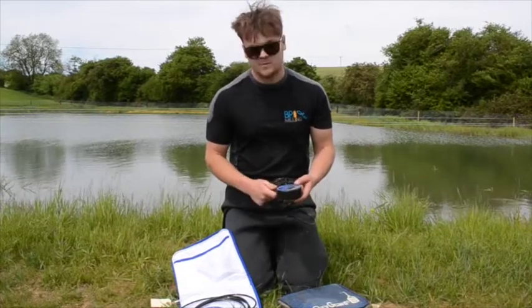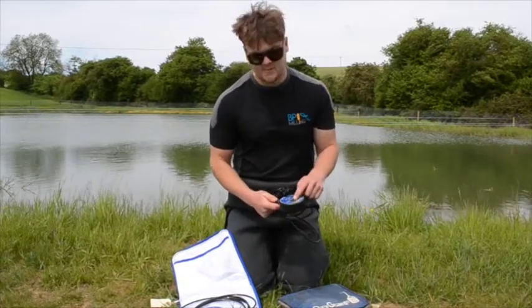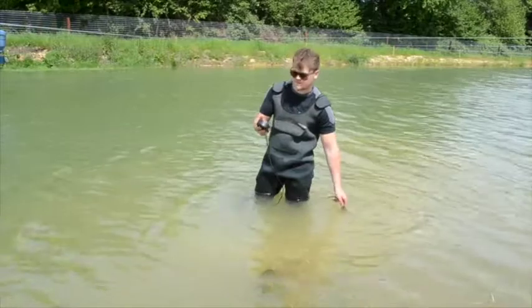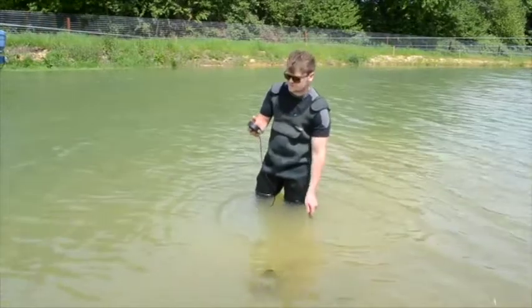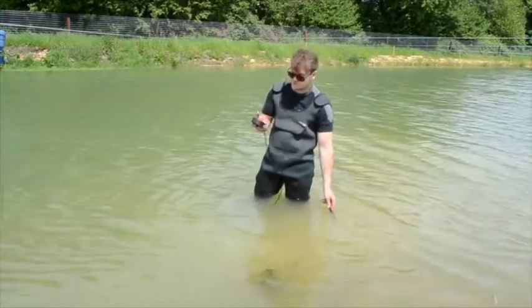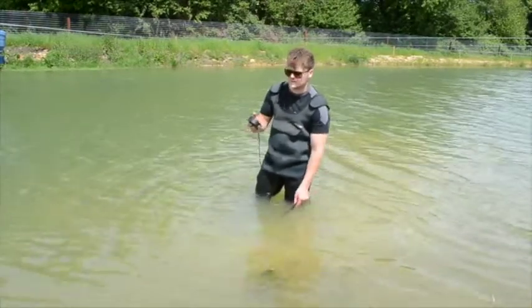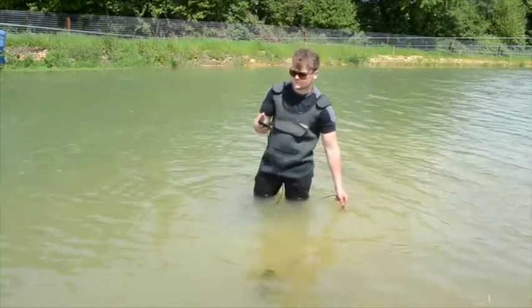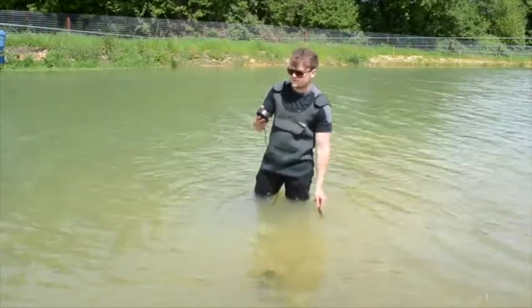One touch of a button it's on and reading oxygen. If it needs calibrating you'll get a message on the screen telling you. To use it, get the probe in the water and keep it moving. Wait for the temperature to settle down - sometimes takes a couple of minutes once you've got it out of the bag. Let it acclimatize to the water temperature, and once it's settled that's when you take your oxygen and temperature readings.